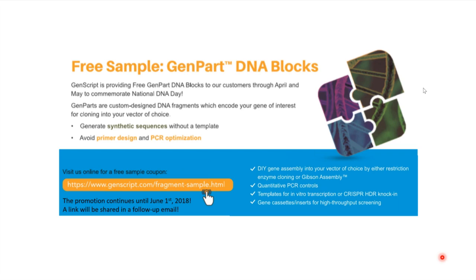Now, one of the limits to throughput in engineering invertebrates is the throughput at which you can introduce the DNA into the host genome. But there are different options for that. Some people use microinjection, but now there have been electroporation protocols developed for insect engineering. And I know there are new approaches being optimized at MIT for microinjection as well that will allow a researcher to let an automated computer system do the microinjection for them. So I think these DNA assembly strategies are relevant to engineering invertebrates as well.